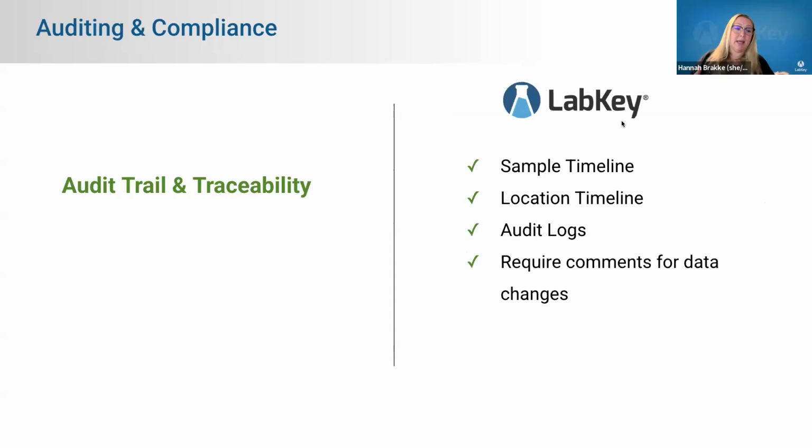And so LabKey, as advertised, definitely has robust auditing. And we do this in a variety of different ways to make it more user-friendly for end users for troubleshooting, as well as maybe QC managers or people that might be reviewing the system. We have our sample timeline tool that is a sample-centric view of everything that's happened to each specimen, and is very good for troubleshooting purposes.